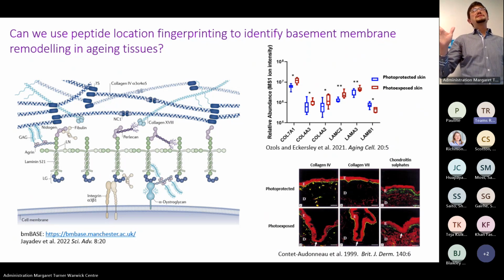of basement membrane proteins. Now, this is why I say abundance and solubility go hand in hand. Here we see a decrease, a disappearance of the basement membrane, and in the mass spec that manifests as an increase in abundance. But all that's really happening is that because the basement membrane is becoming more soluble, we see more peptides being liberated, and so that manifests as an increase. And so it's a change that goes hand in hand with what we're seeing in the histology.